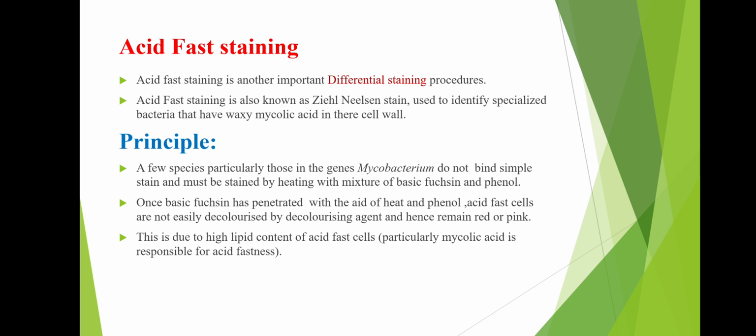The next differential staining method is acid-fast staining. Acid-fast staining is another important differential staining procedure. Acid-fast staining is also known as Ziehl-Neelsen staining. It is used to identify specialized bacteria that have waxy mycolic acid in their cell wall.